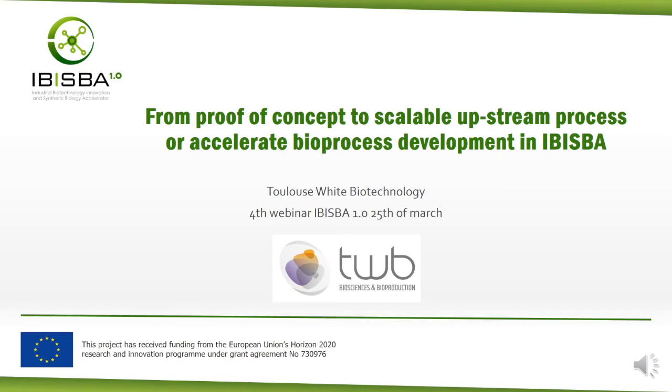I would like to thank the IBISBA Organization Office for giving me the opportunity to present the different services that TWB can offer. In this webinar, I will present the TWB approach and tools concerning the setup of bioprocess from the early stages of a proof of concept to a 200-liter production demonstration. A typical situation that TWB often encounters is the contractualization with many biotech startups and with emerging projects of big biotech companies.